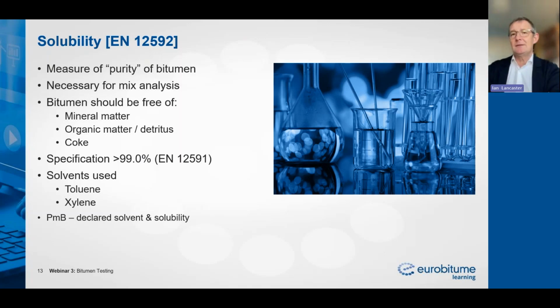The next method I'm going to talk about is solubility. It's important to know that bitumen is pure, if you like. It shouldn't be contaminated with mineral matter, coke, rust, any other form of detritus. So we need to have a method for ensuring how pure the bitumen is.